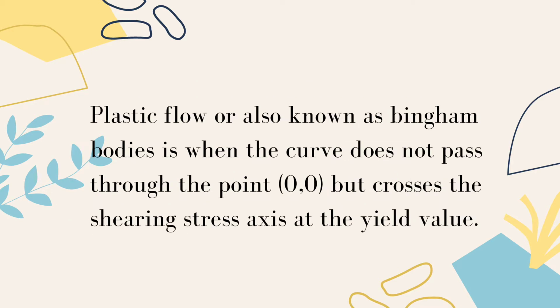Plastic flow, also known as Bingham bodies, is when the curve doesn't pass through the point 0,0, but crosses the shearing stress axis at the yield value.